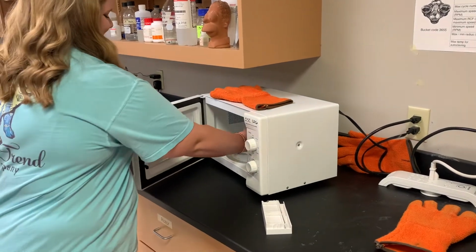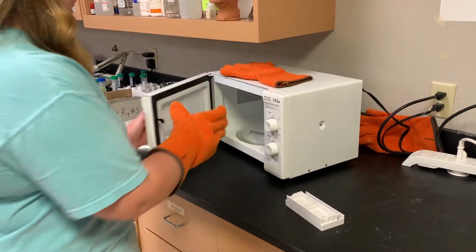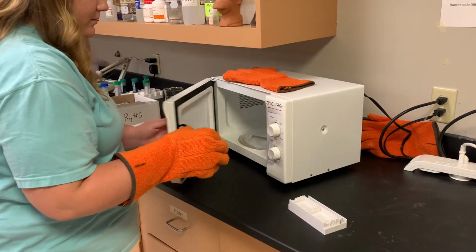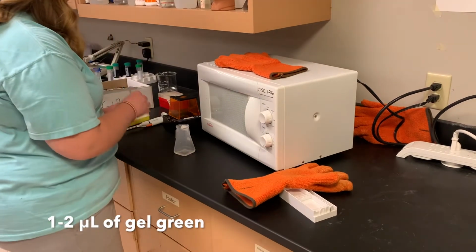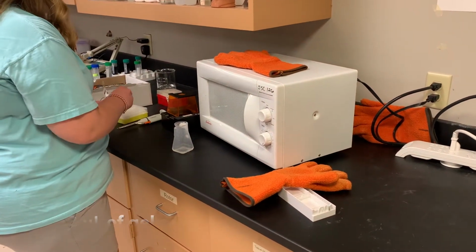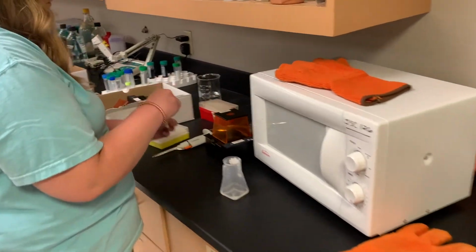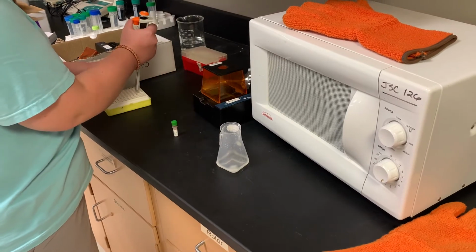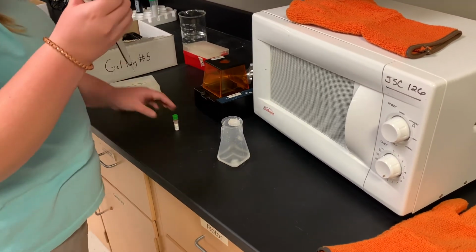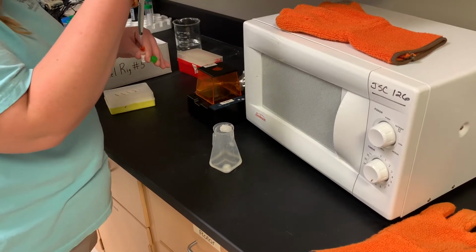Heat the agarose mixture in the microwave for 1 minute in a plastic container. Carefully remove the container from the microwave. Add 1 to 2 microliters of gel green, which will aid in visibility after the gel is run. Make sure to leave the tube of gel green in the dark at all times it is not in use.